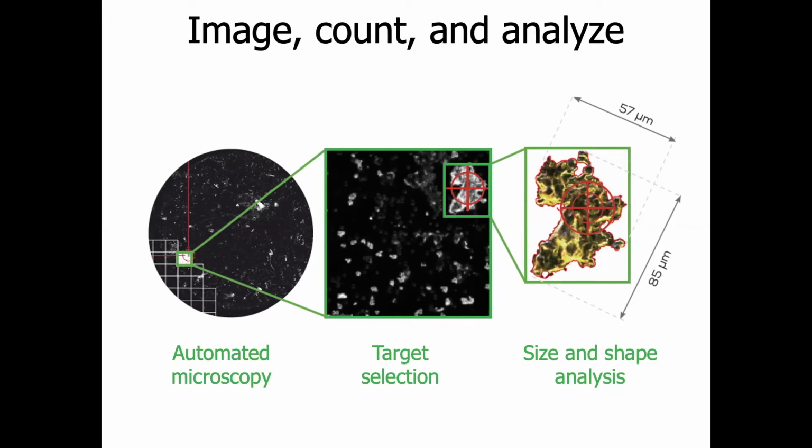All the particles in this area will be found by binarizing those images, and particle sizes, shape parameters, and coordinates are stored. Based on user-defined selection parameters, using size, elongation, or other shape parameters, particles are then chosen for analysis and automatically analyzed using Raman or LIBS.